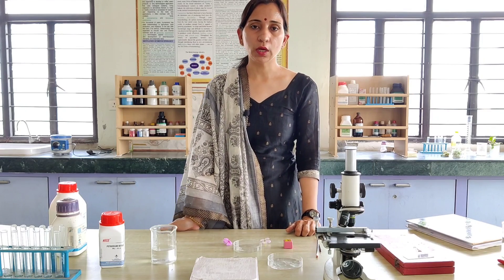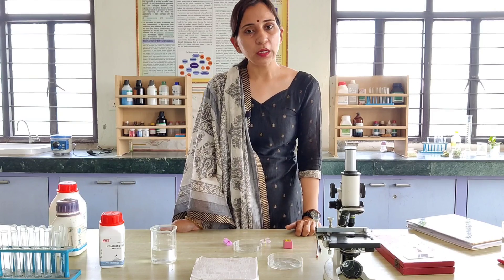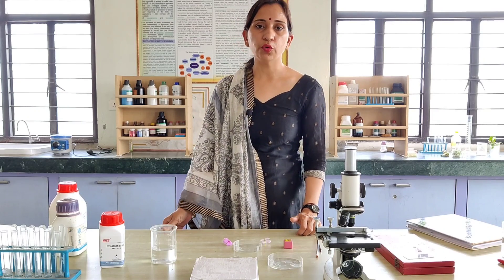Hello students, today we are doing pollen germination. Let's see what the requirements are for this experiment.